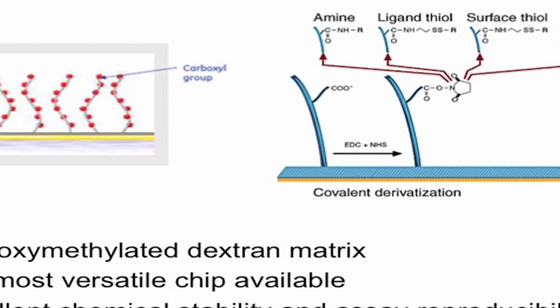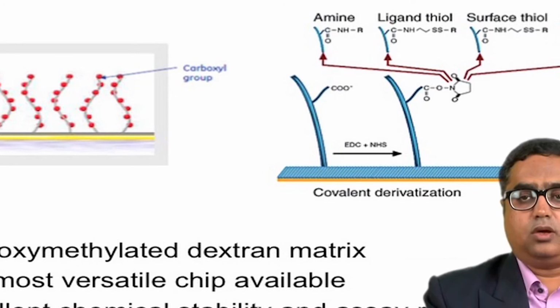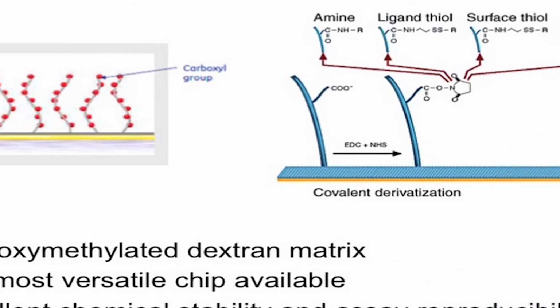The reactive side chains on the basic amino acids, or amines, are generally used to couple to the surface by amine coupling. Thiols are activated and then used to immobilize on the surface in a thiol coupling, whereas the carbohydrates attached on glycoproteins are used for immobilization, and that process is an aldehyde coupling. And as I just said, CM5 is a very versatile chip, and any of these methods can be used to immobilize on a CM5 chip.